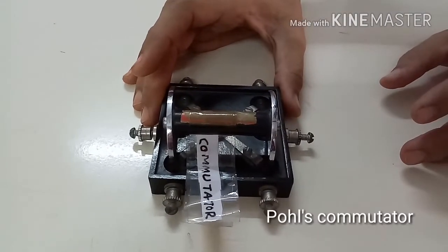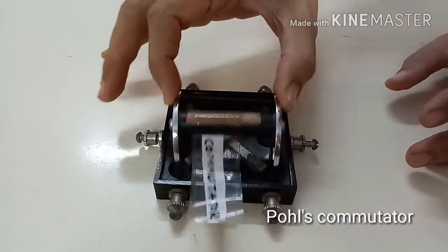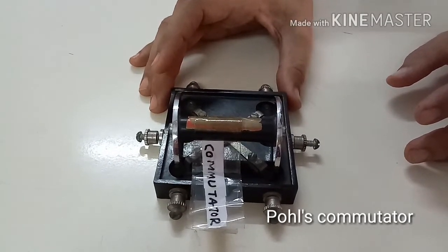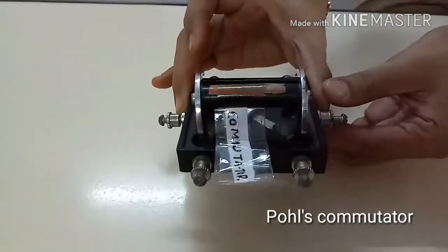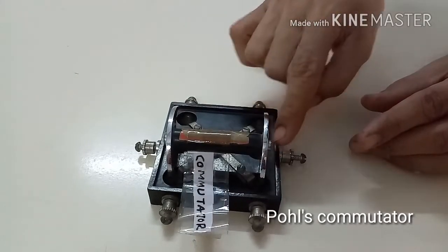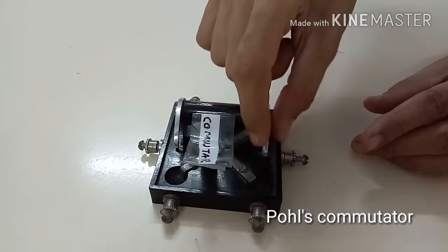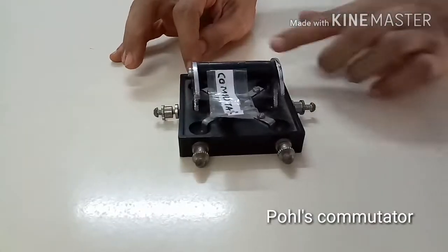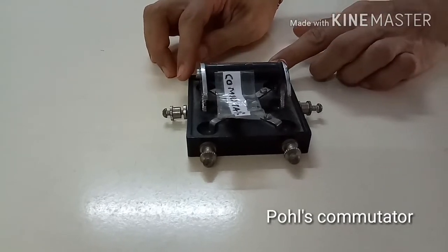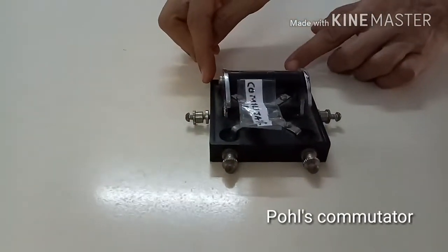Next is Pulse Commutator. It is a modified mercury key acting as a two-way switch. It is used to change the direction of current. It consists of a vulcanite base on which a rocking metallic cradle is mounted. There are six cup-like depressions filled with mercury, and six terminals are attached to these cups. The electric current is diverted to two different points of a tissue through the electrodes connected at either ends.